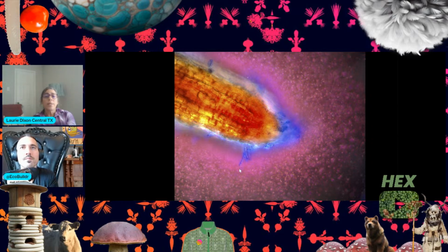And these bacteria and also the arbuscular mycorrhizae that form relationships within the root, they autofluoresce in that light because of the phosphorus. So they actually glow. And that enables us to see not only the stuff happening in the soil, the microorganisms in the soil, but we can begin to see those symbiotic relationships that the fungi is forming with the root.